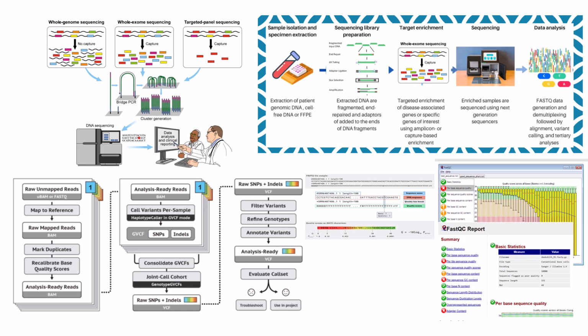Got it. Okay, library stocked. Now we get the raw DNA sequence data, fresh off the sequencing machine. It's probably not perfect, right? You can't just compare that directly to the nice, clean reference map. Oh, absolutely not. No way. Just like any physical sample needs prep and quality control in a wet lab, this raw digital data needs serious cleaning and validation. That brings us to phase two, preparing the patient data: quality control and cleaning.